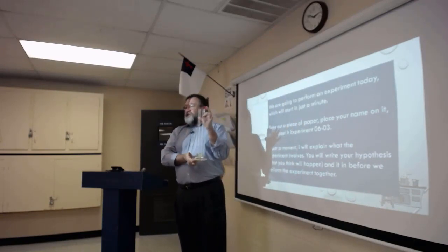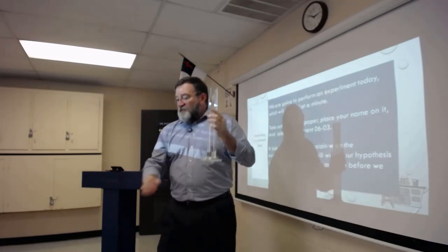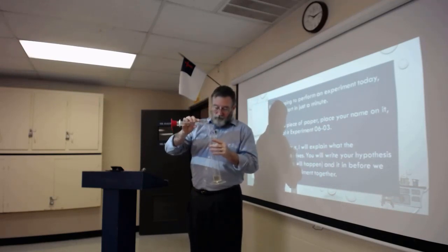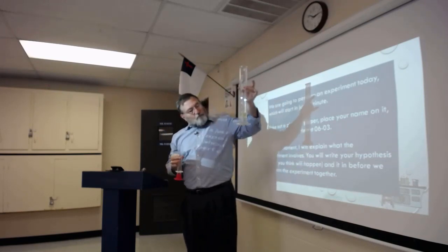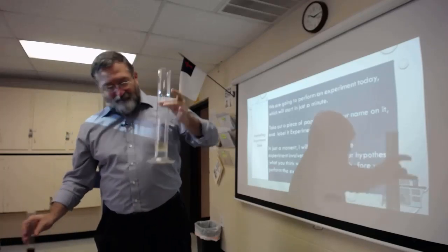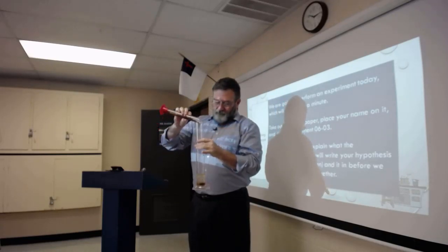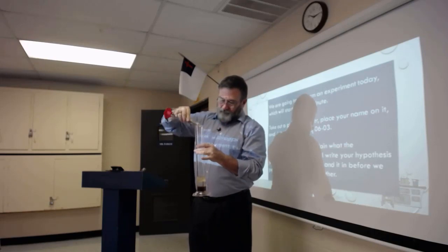This is quite a large graduated cylinder — it can hold 500 milliliters. We're only going to put 150 milliliters in here, so it looks relatively small. To this 50 milliliters of canola oil, I'm going to add 50 milliliters of H2O — water.